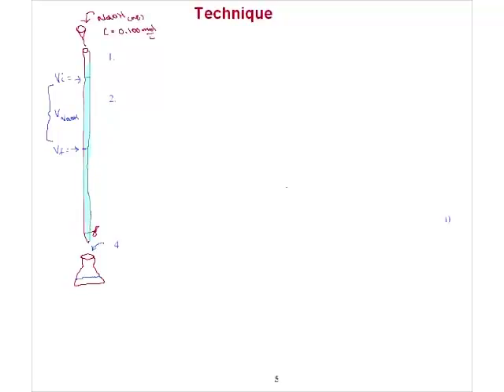All right. Now before you fill it up, I'm skipping a step here. Before you fill it up with the sodium hydroxide, what we want to do is make sure the burette is rinsed with soap and water, and then rinse with water several times to get rid of all the soap. We want to make sure that this is clean. And once we rinsed it with some water several times, we want to rinse it with our sodium hydroxide just a little bit, because if there's any water that's inside the burette, we don't want to dilute our standard solution.